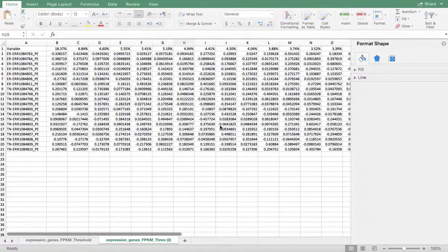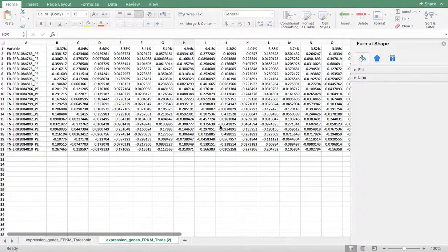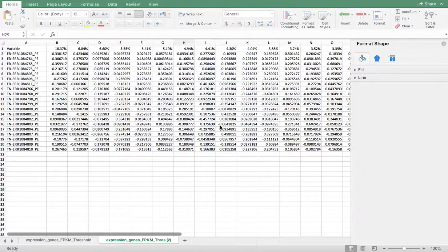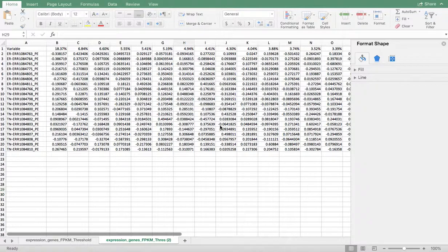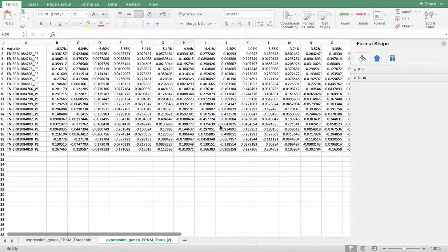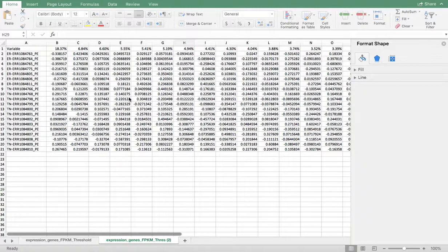This is a quick video to demonstrate how to take your variables from the PCA results and work with the numbers to show the PCA image, the graph, the scatter plot that you can interpret in some way. Just a very quick tutorial on how to do that.